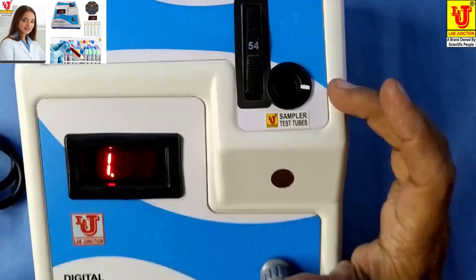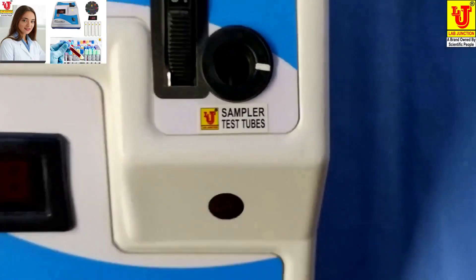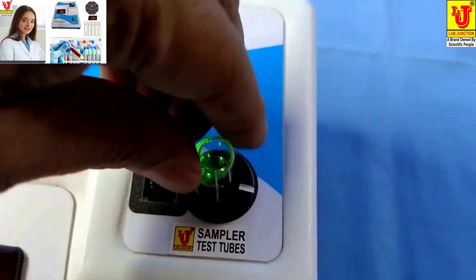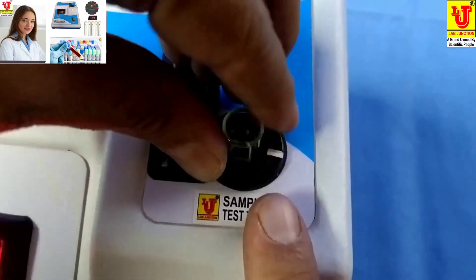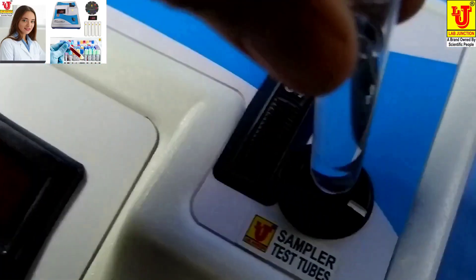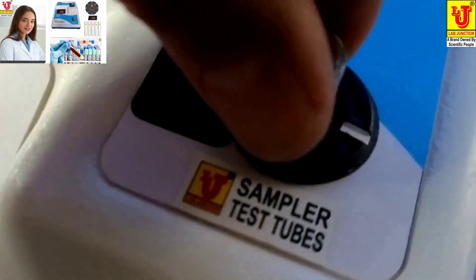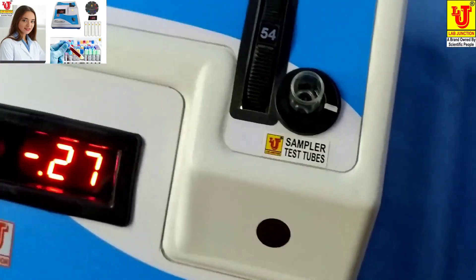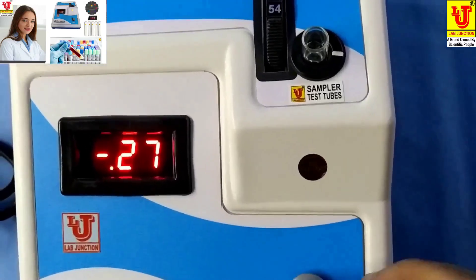This is the sampler for test tubes. First, insert your blank into the test tube holder like this. Coincide this mark with this mark, and properly insert it. Then set to point double zero using the set OD knob.